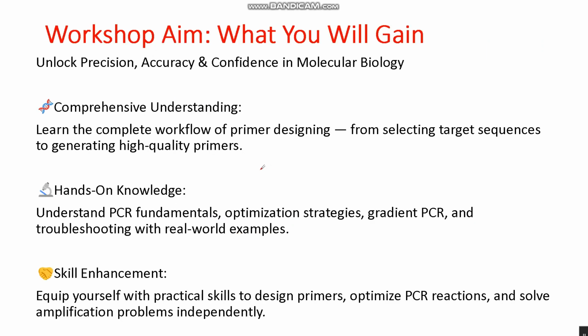Okay, what is the aim of the workshop? It is actually to unlock precision, accuracy, and confidence in molecular biology. It has three basic aims. First of all, comprehensive understanding: you can get a complete workflow of primer design, from selecting the target sequences to generating a high quality primer.